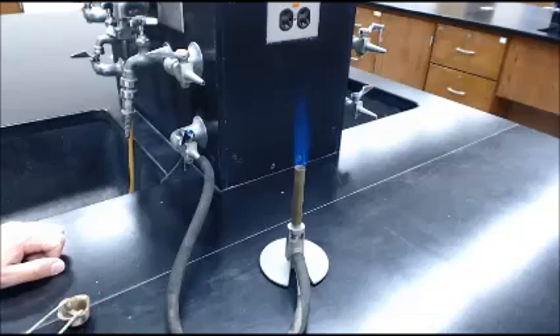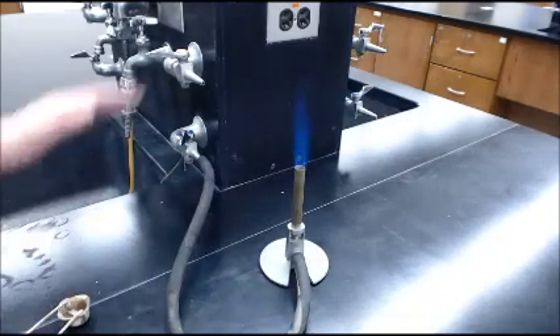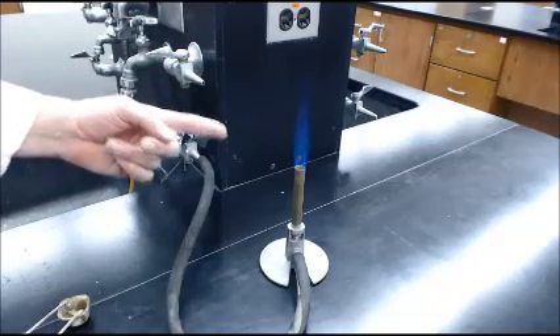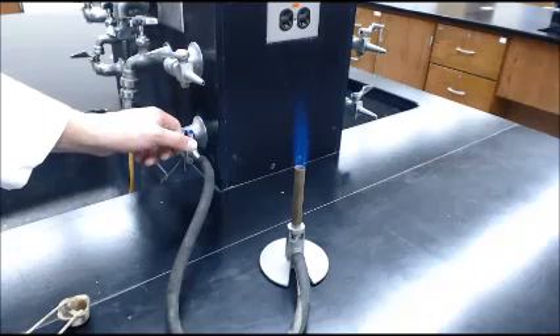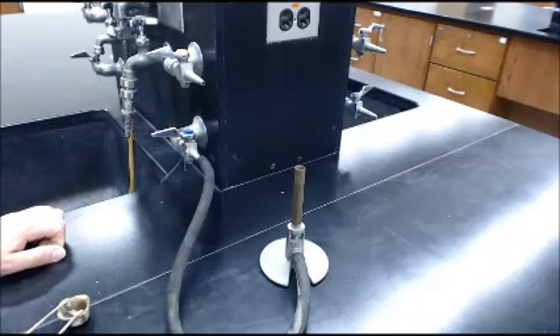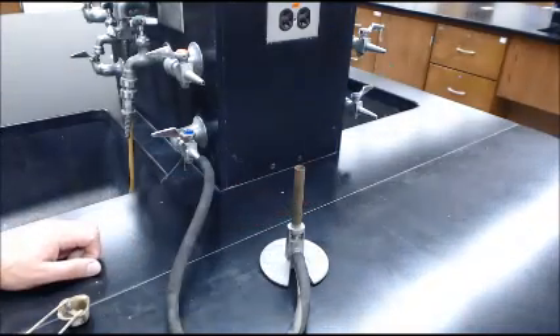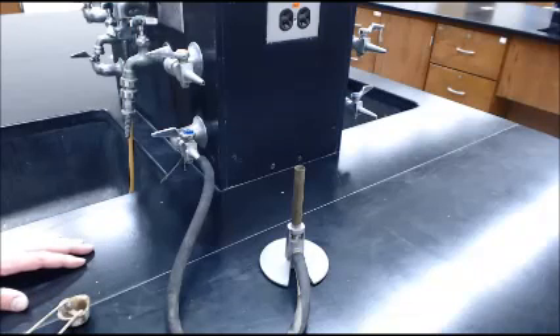And so that's our basic operation of a Bunsen burner. You can move your crucible and whatever you need onto it. It's very hot up here, of course. Now to turn it off, or in case of emergency, you can turn it off right here. And that's it — you're done. Be careful, it could be hot. When you're done, give it a few moments to cool down and it should be just fine. That is the operation of our Bunsen burner here in General Chemistry Lab.